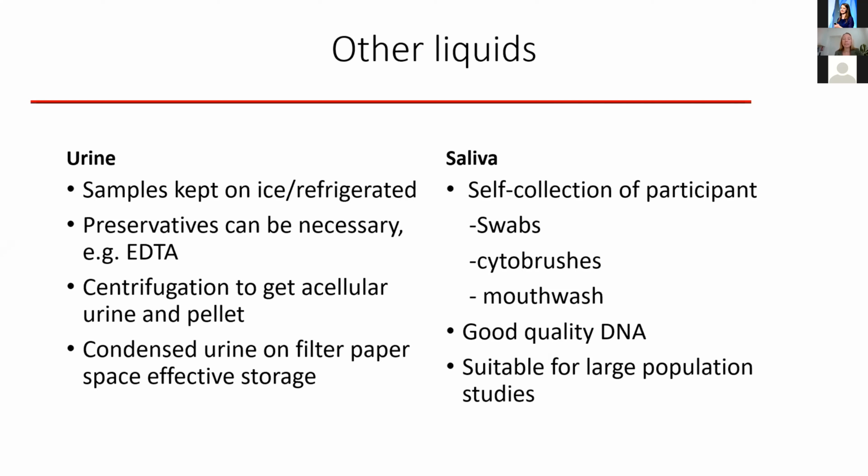Saliva is a good opportunity for self-collection by participants. They can then use swabs, cytobrushes, or mouthwash and send the samples in instead of meeting someone to sample them. This can generate good quality DNA and is suitable for large population studies.